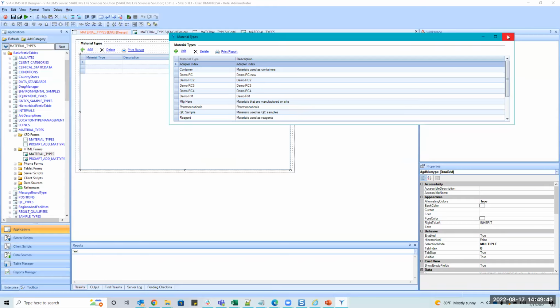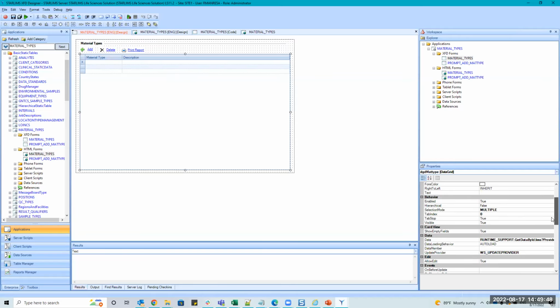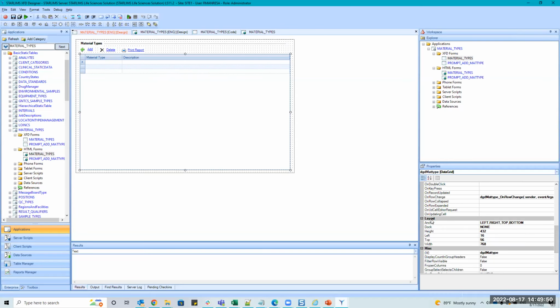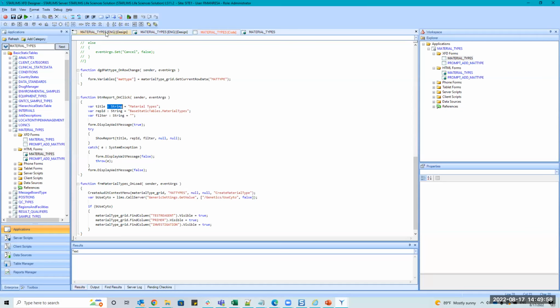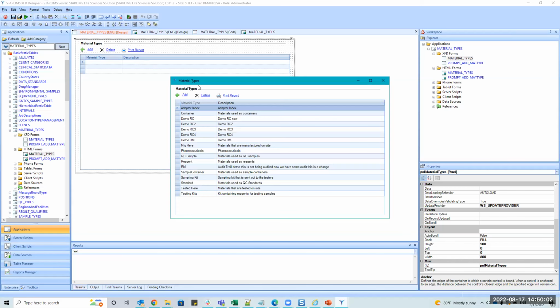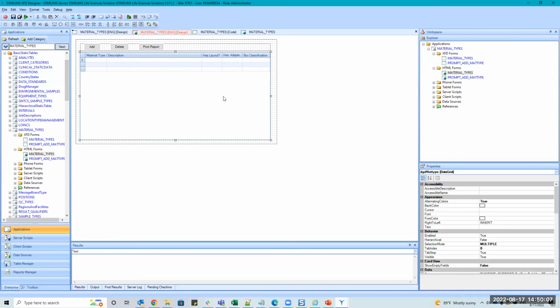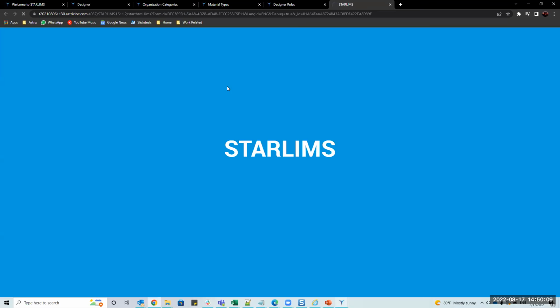So for all of this, back in the days, it was very different than it is now. Back then it was the layouts and really anchoring and docking. These two were the main things. However, now it's a little different. Again, the behavior should be the same, if they did a good job here. Let's see.